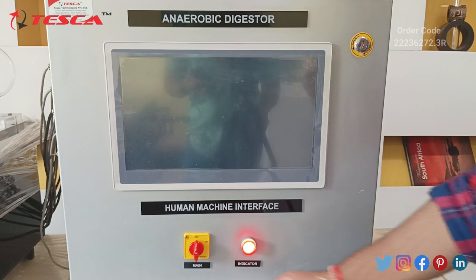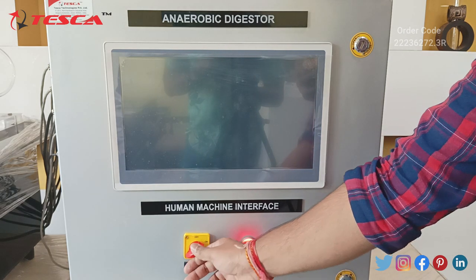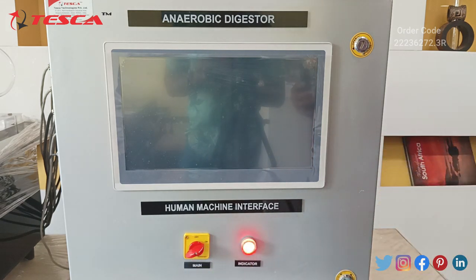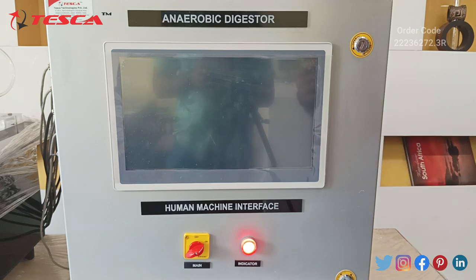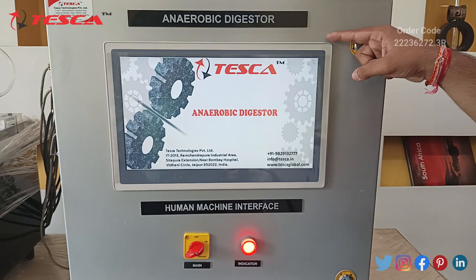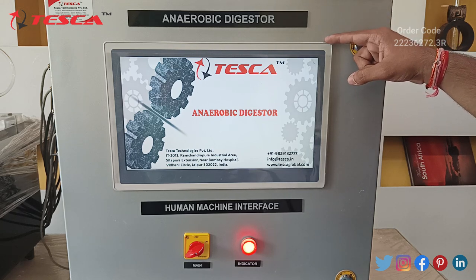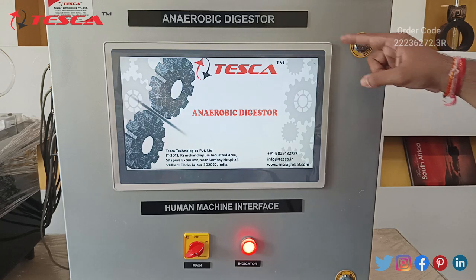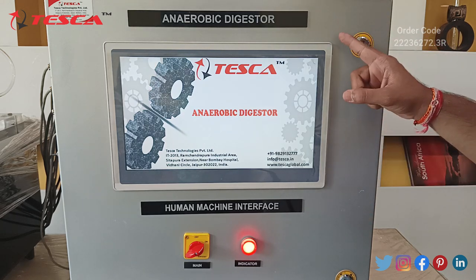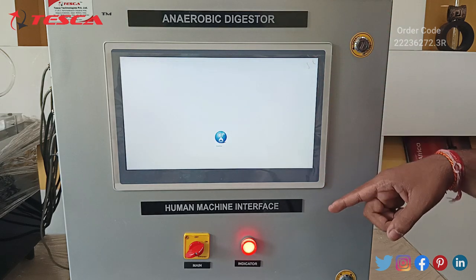Now let's move ahead to the next unit of our anaerobic digester. As you can see, this is our control unit of the anaerobic digester which controls our working unit. Here we have our 15-inch TFT display through which we can control the working unit.